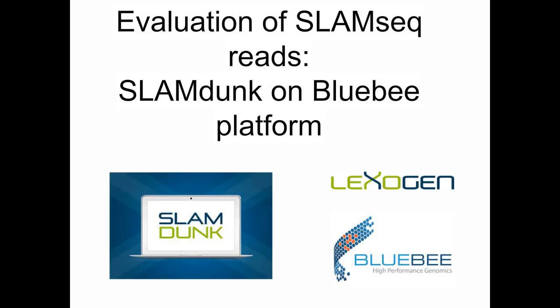So this is a really great question, and I think there were a couple of other questions that came up in regards to this. QuantSeq is a really ideal library prep method for SLAM-seq experiments. One of the main advantages here is that you're profiling 3' tags from full-length mRNAs so that you know these mRNAs are coding for fully functional proteins. And the other advantage of QuantSeq is that you only need 1/10 of the read depth that you would need for a usual mRNA sequencing experiment.